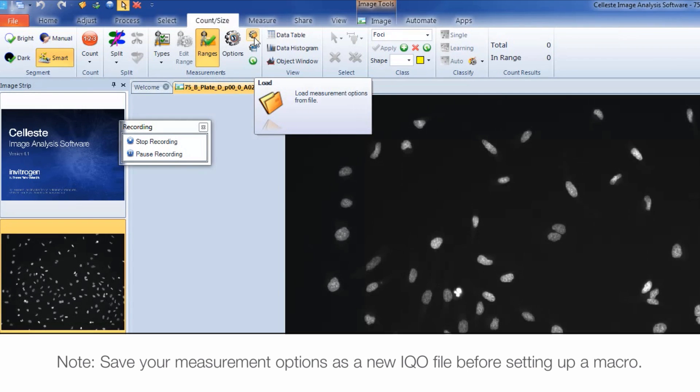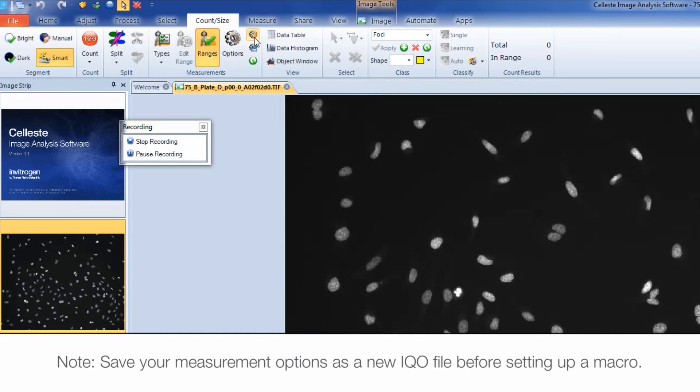If you've not saved a settings file but have started recording your macro, you may pause the macro recording and create one at this point.